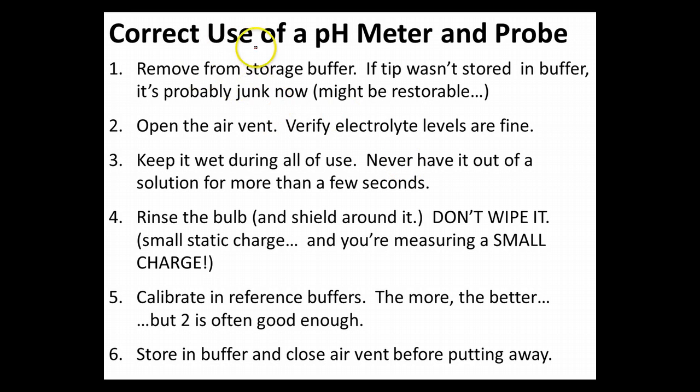The first thing you should do when you get out a pH meter is remove it from its storage buffer. If it wasn't in a storage buffer, the tip has dried out. If you remember from the video where we talk about the junction potential on the glass surface and what's actually happening inside the glass, it has a hydrated gel layer. If that layer has become dehydrated, we're going to have a whole lot of crud become part of that membrane, plus it's just turned into a dry network instead of a wet one. You might be able to restore it by rehydrating it, but there's also a decent chance that it just became junk.